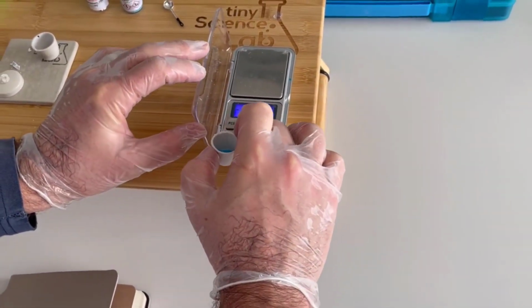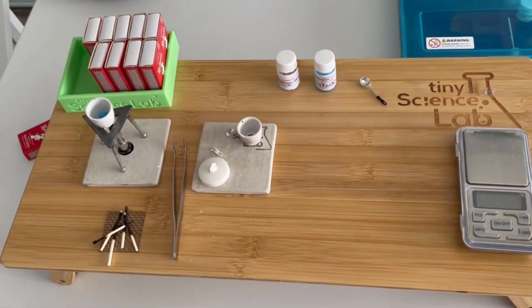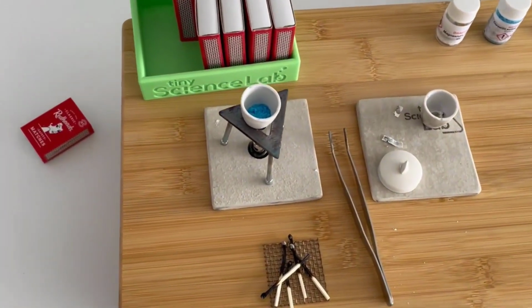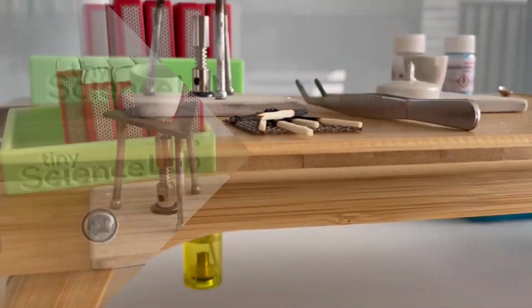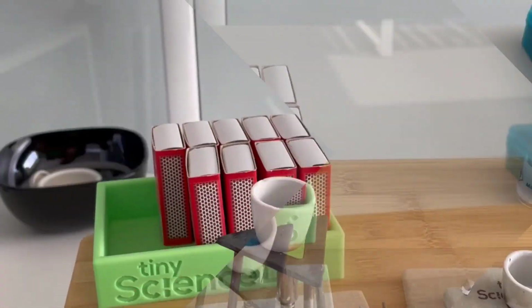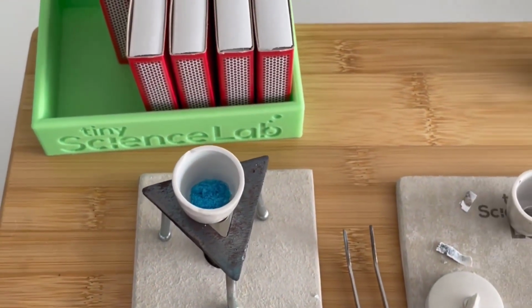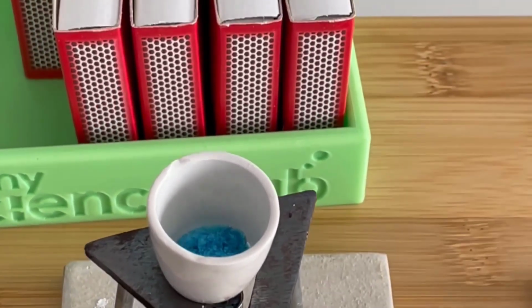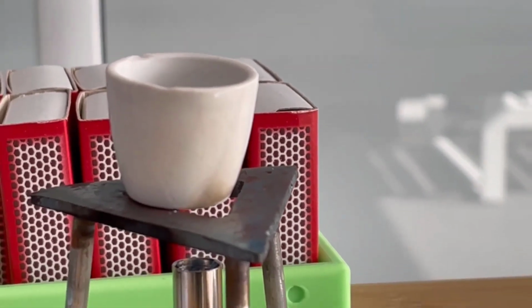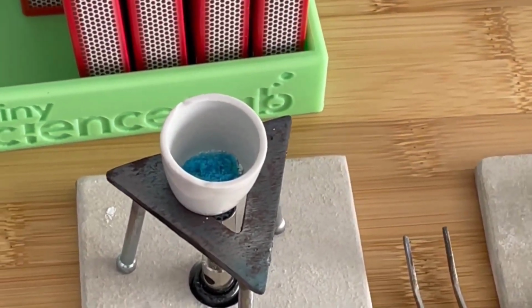So once again, we're going to do the same thing. We're going to come over, turn that off. I'm going to pop that on. I'm going to be very careful because this is still warm from my last experiment. We're going to check how much gas is in there, which still looks like it's okay. So let's set it away. The interesting thing about this particular experiment is we're not going to just drive away some of the steam. You can already see some of that water that is basically boiling in the crystal structure. It's not boiling per se, but what it's doing is it's actually coming out of the crystal structure, which is going to change the appearance of the copper sulfate as well.